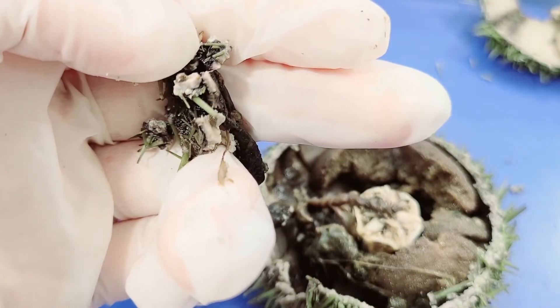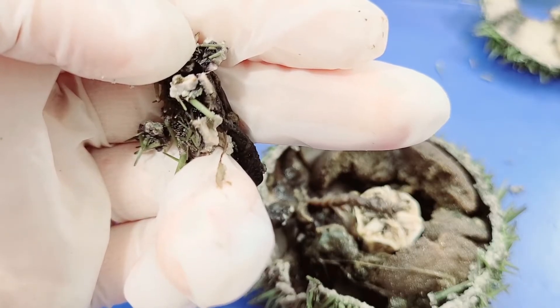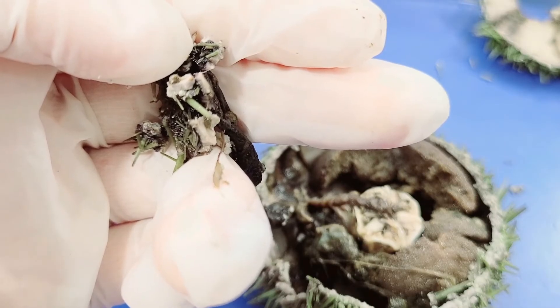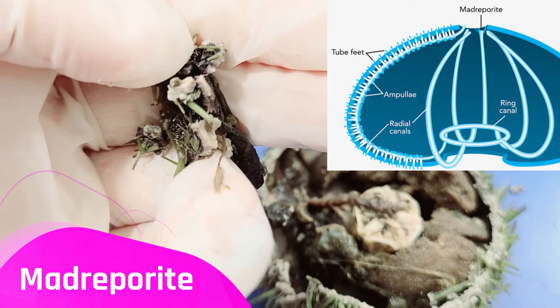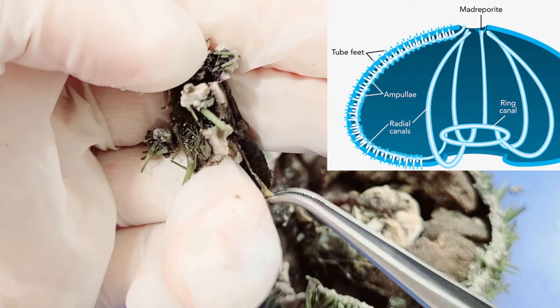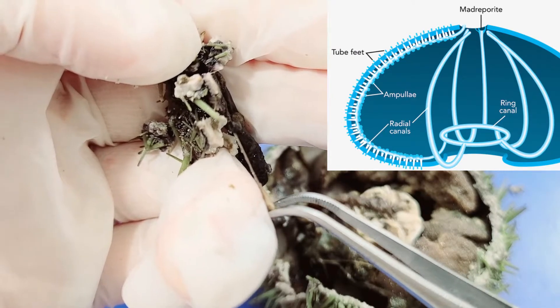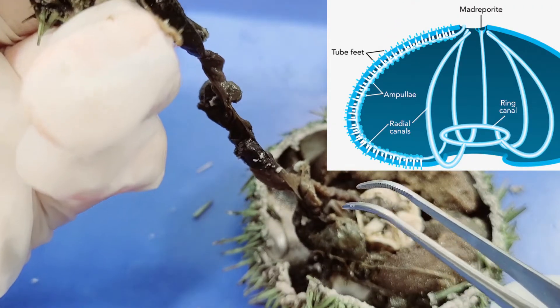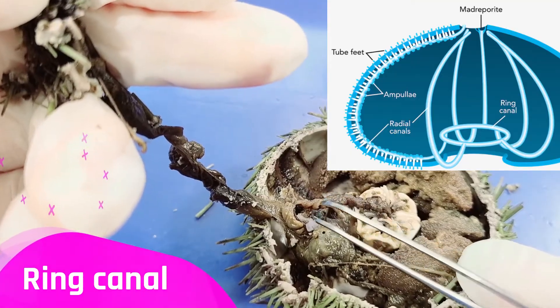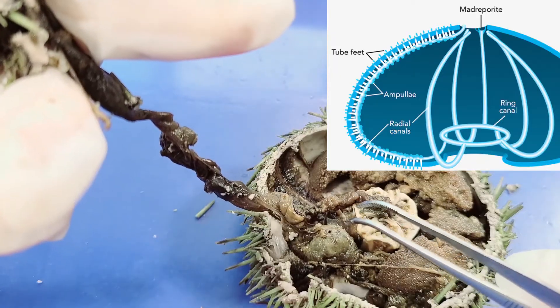Now let's take a look at the water vascular system — the hydraulic system that moves the tube feet. Water is drawn in through the madreporite, then goes through the stone canal, which travels down to enter the ring canal that encircles the esophagus at the center of the sea urchin.